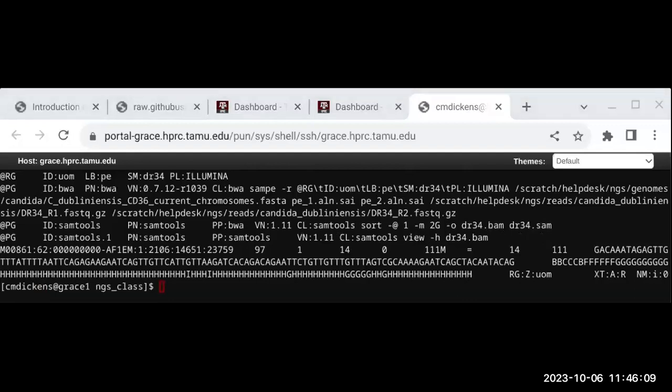All right, what's in the SAM format? Is it useful to look into this? One thing that's useful is the flag. There's an option in SAMtools called flagstat. It gives you the statistics of the flag. The flag is, there are a number of bits here. Notice these bits are numbers that are not duplicated. And to get a flag of 99, there's only one combination of these numbers that you can sum that equals 99, and that's this. So now 1, 2, 32, and 64 define characteristics of this alignment.